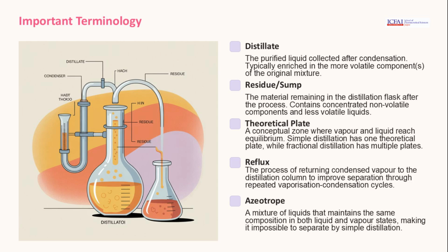Key distillation terminology includes distillate, residue, theoretical plate, reflux, and azeotrope. Understanding these terms is essential for grasping the distillation process and its nuances, aiding in effective separation and purification.